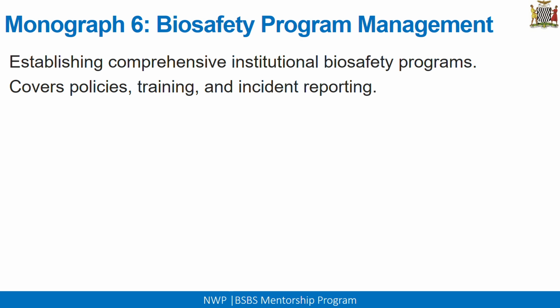Basically, this one is mostly for those laboratories or organizations that want to set up a biosafety or biorisk management program, or biosafety management program to be specific. So how do you establish a comprehensive institutional biosafety program? It gives you that information. Then it will also cover how you may come up with your policies. How do you make sure that your policies are well tailored and aligned to your goals? Then how do you do your trainings, and how do you manage your incidents in your facility?